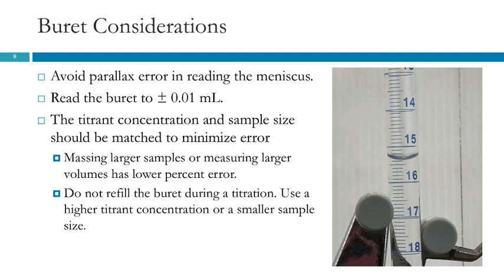You know, technology exists, and so we might as well use it. It can be pretty fiddly to read a burette. If you take a picture of it, then you can look at it at your leisure, right? Although I will say, having taken that picture myself, that taking a picture of it is a bit fiddly too.